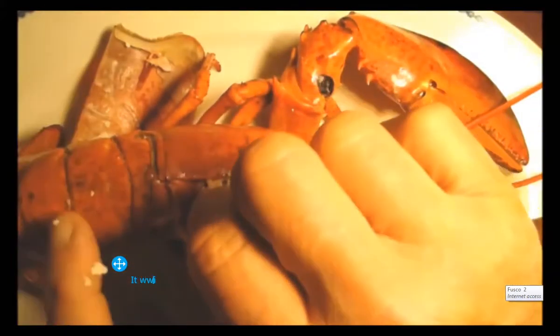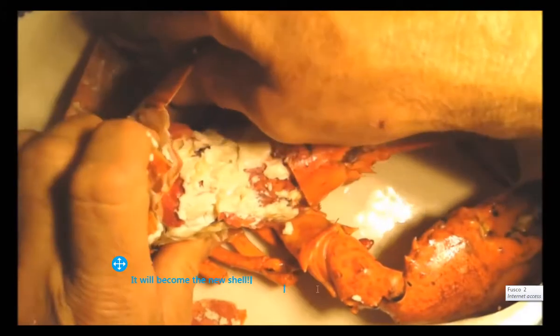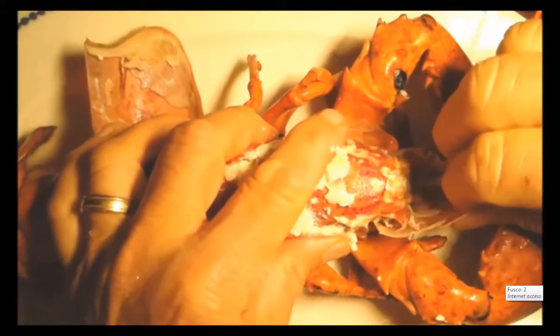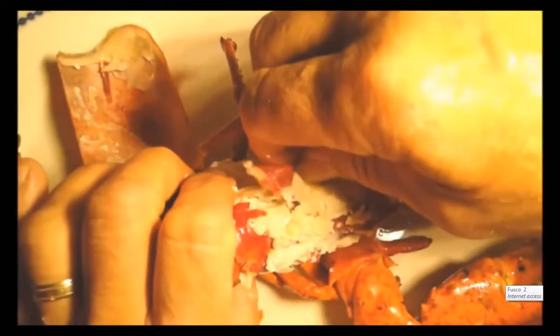I wanted to show you that. I'm going to peel this away and peel the other side off so you can see the inside of the lobster. Everything in here would also come out of the shell for it to grow, but I want to take this off and see if I can do this neatly.